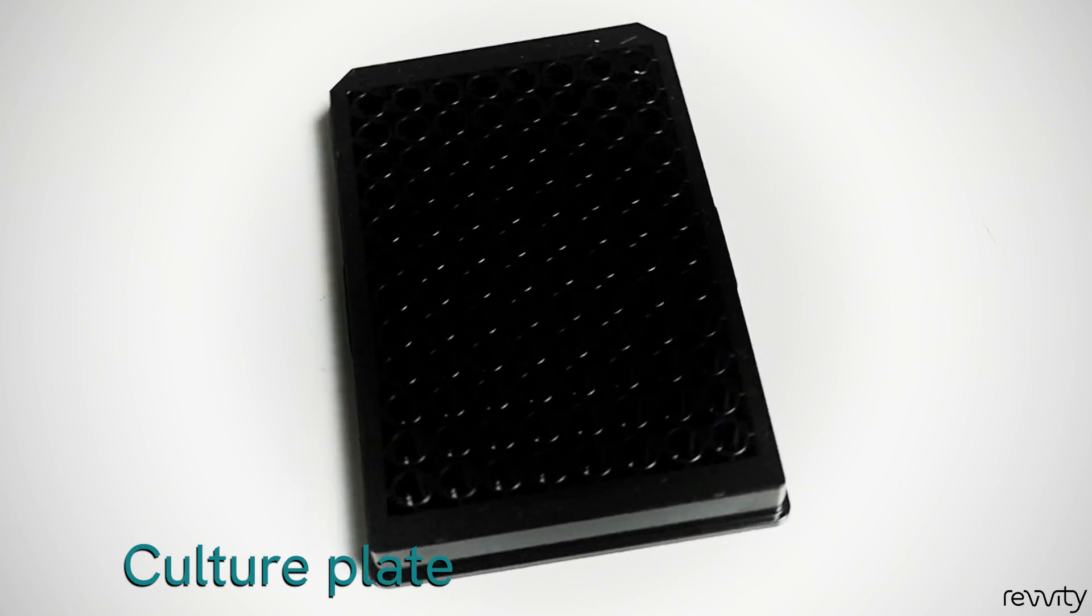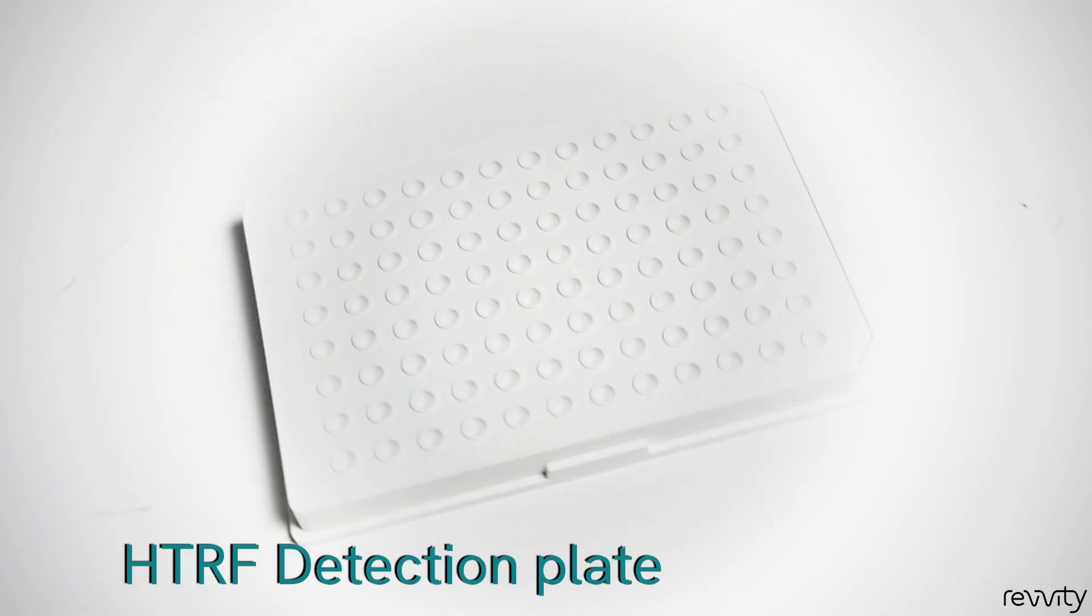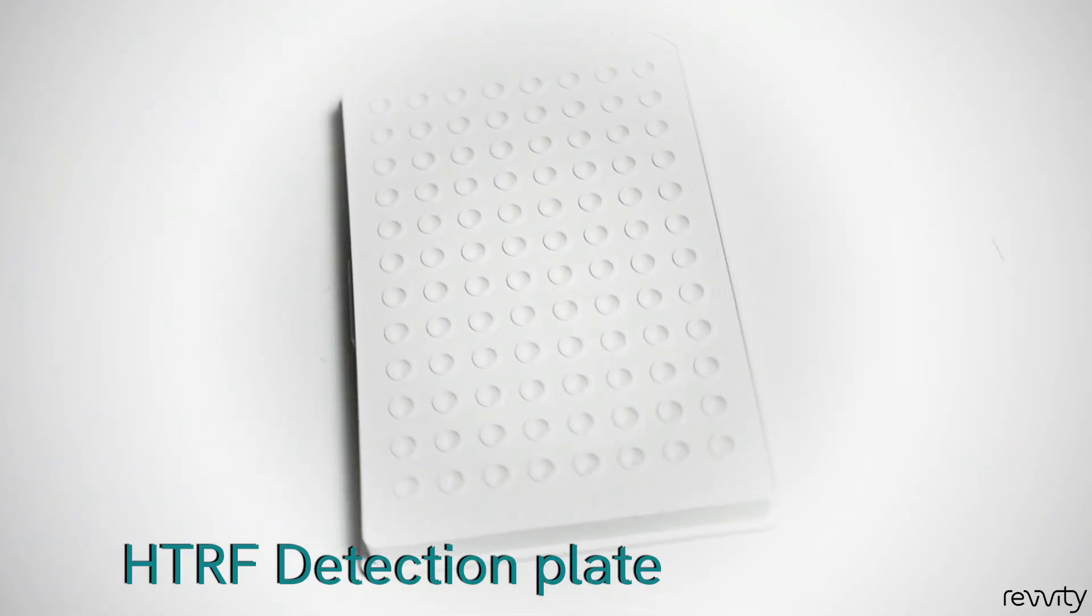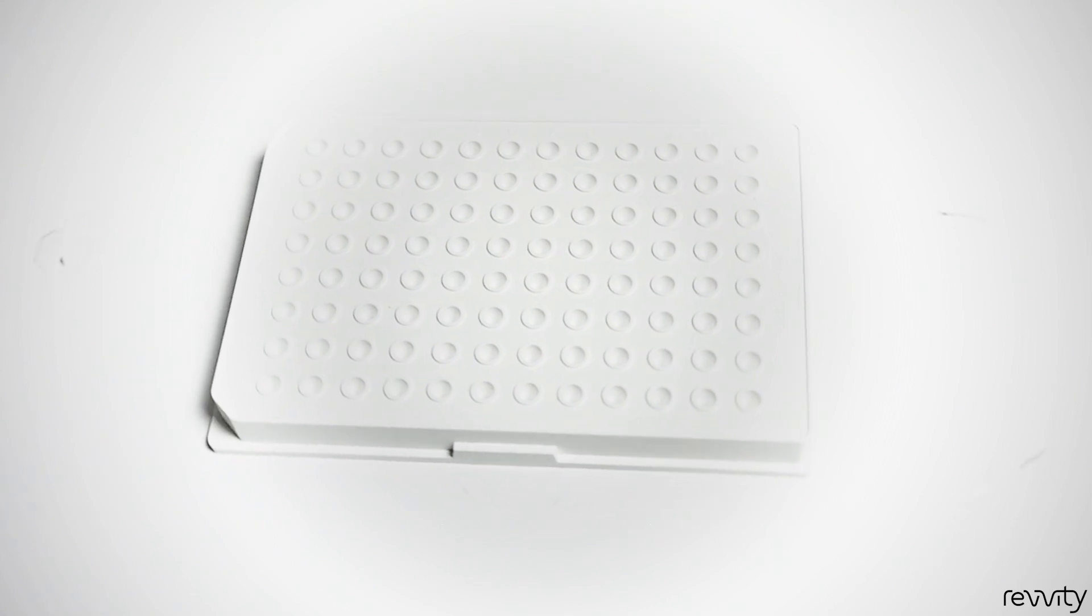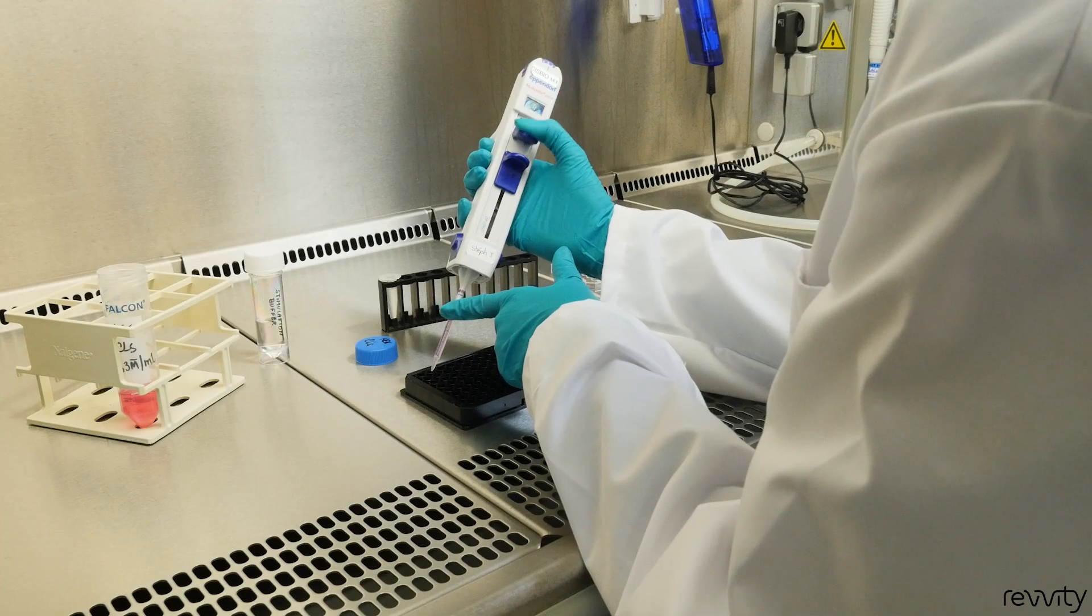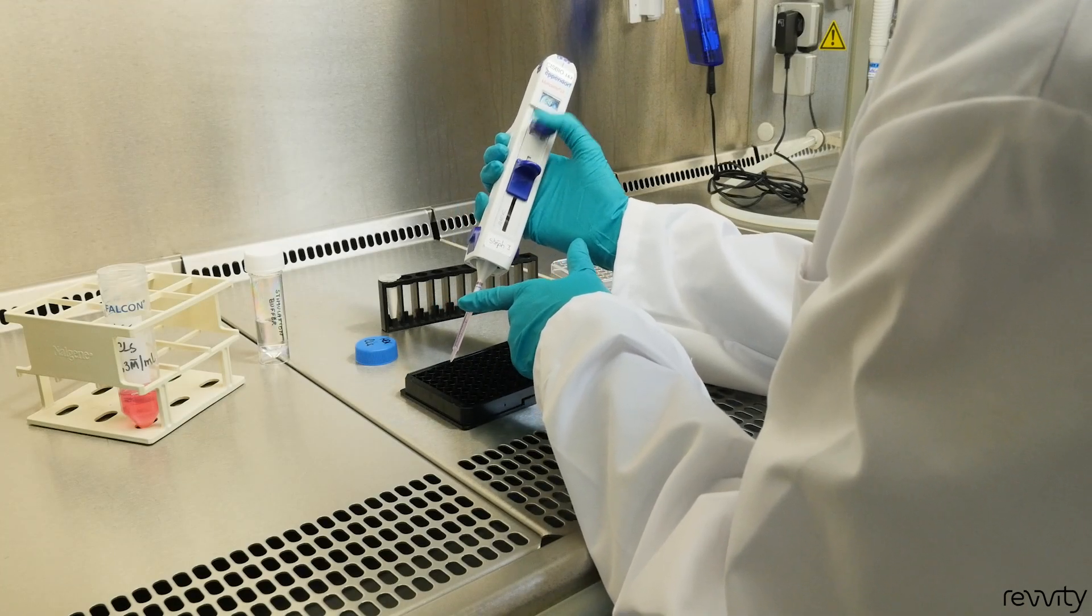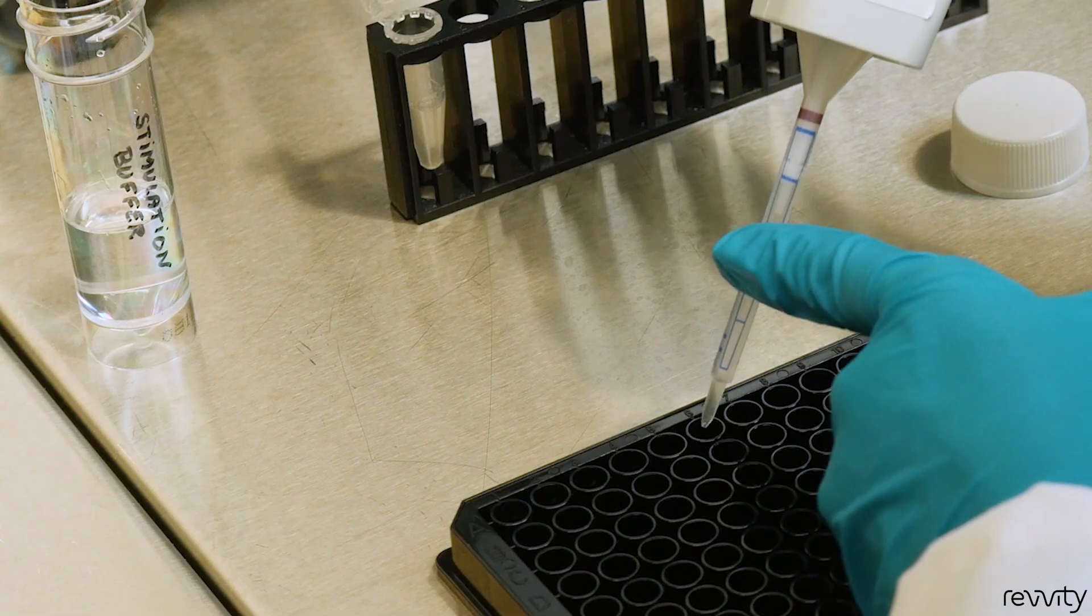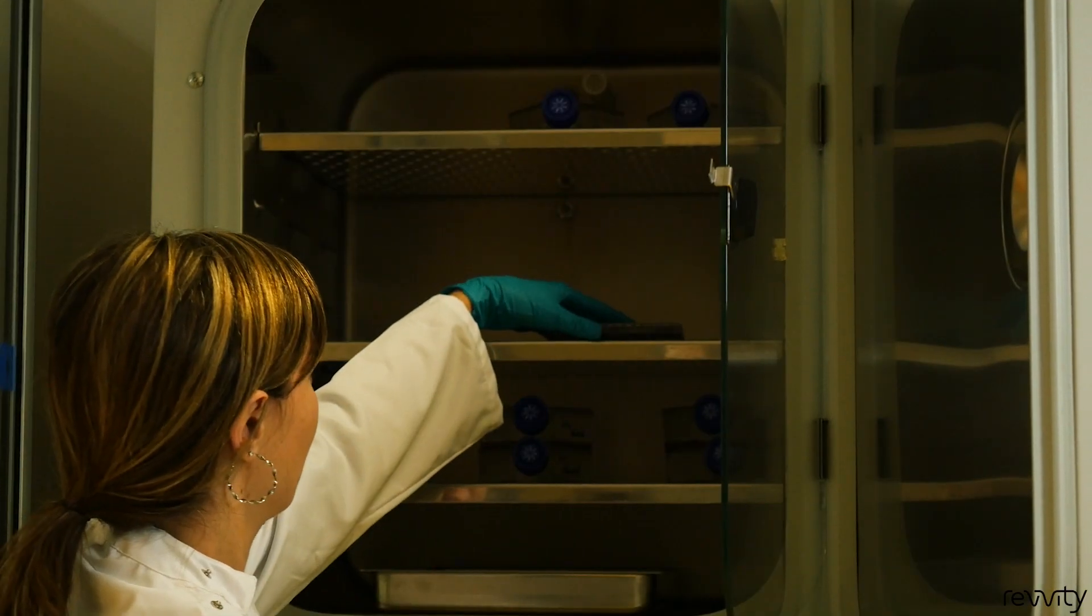This protocol is a transfer assay where cell treatment and lysis are made in the culture plate and detection is made in the HTRF detection plate. Plate your cells, then add the molecule of interest. Usually treatment time is between 10 to 30 minutes.